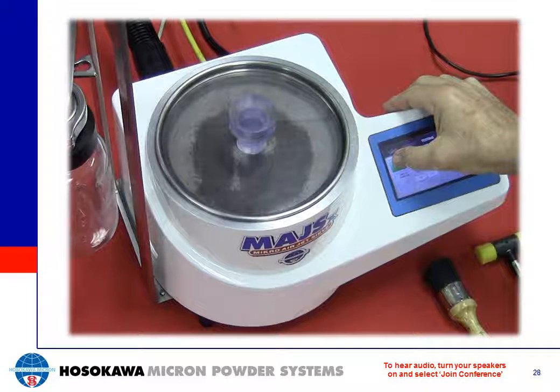When utilizing the pneumatic sieving principle in the Hosokawa Mikro airjet sieve, you always want to start with the finest screen first. When starting with the finest test sieve screen first, you're going to remove any fines from the product. This is going to eliminate any potential for agglomerations, which can skew your results.